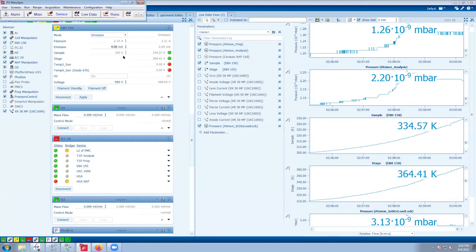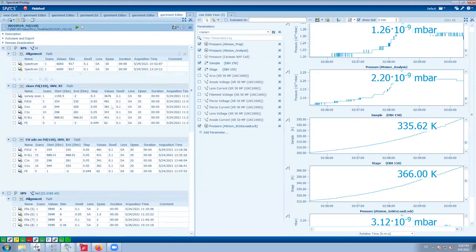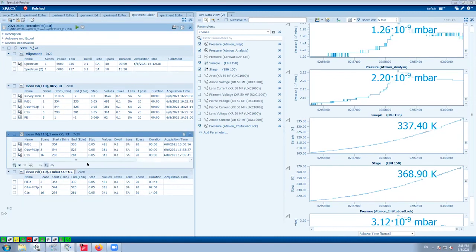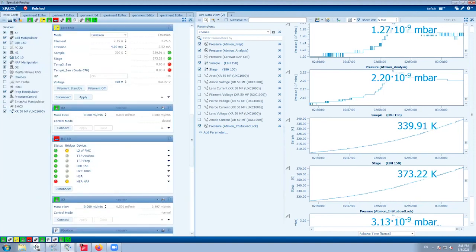Those different points on the surface would have a bit different potential. So electrons leaving from one side of the measurement spot and the other side could have a bit different kinetic energy, and then it results in some asymmetry of your peak, or simply broadening. Yeah, that's right, I can understand that. If it's only 0.1 volt, then you have a very small potential drop. But it depends, of course, on the material, if the 0.1 is enough to have some reasonable current.